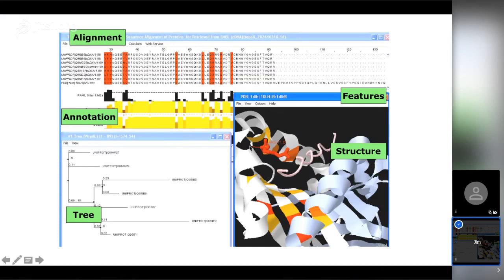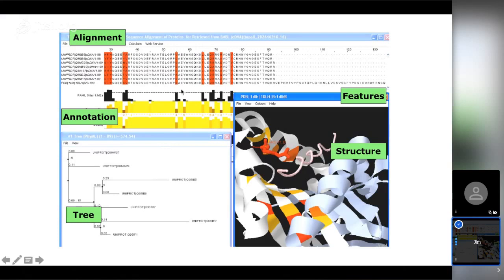This is a positive selection analysis which I did some years ago, where I took a protein sequence alignment and converted it into a series of codons — a codon alignment — then performed a phylogenetic analysis to get a tree. Based on the tree and the protein sequence alignment, I used a program called PAML which does a statistical analysis of the variation of the nucleotides to determine whether long branches of the tree correspond to particular columns of the multiple sequence alignment. The histograms here represent the PAML sites — regions varying significantly according to the evolutionary relationship between these sequences — suggesting there has been some specialization, where evolution has adapted these genes to do something particular.